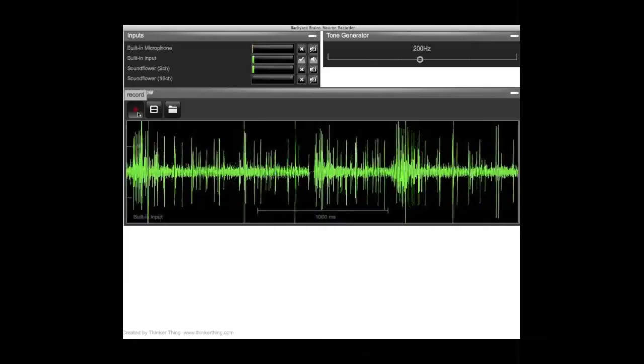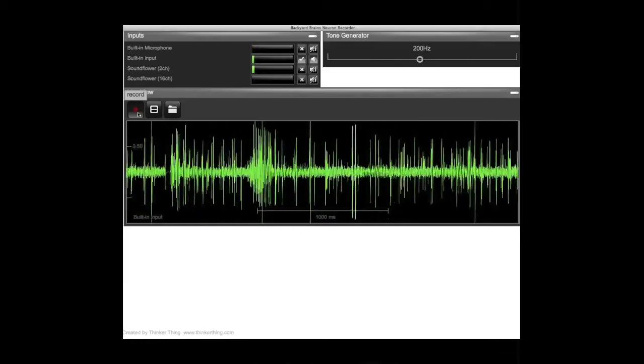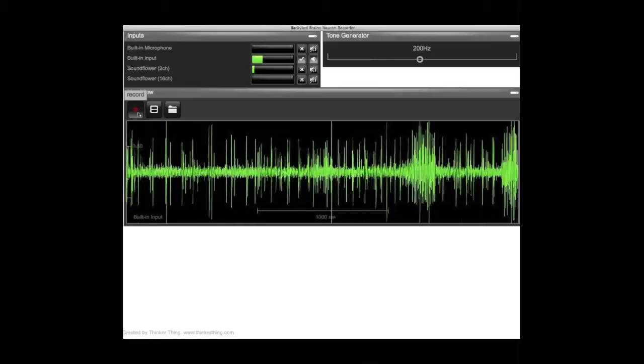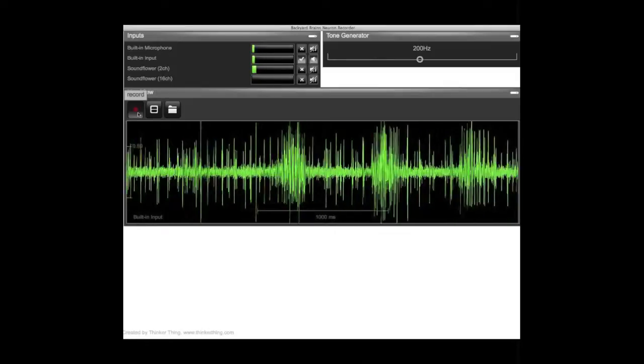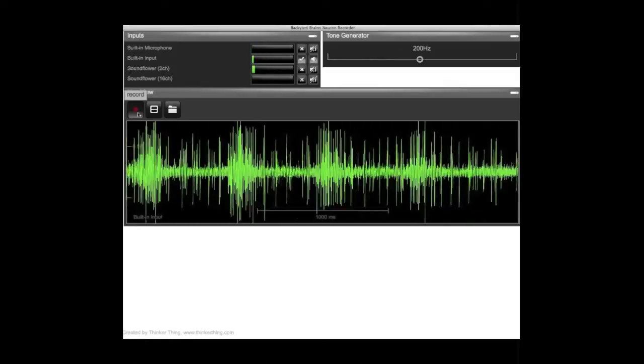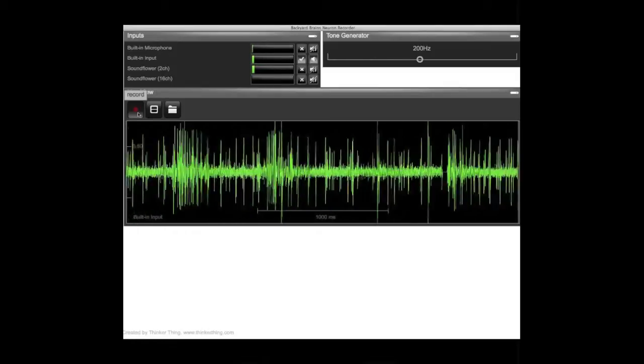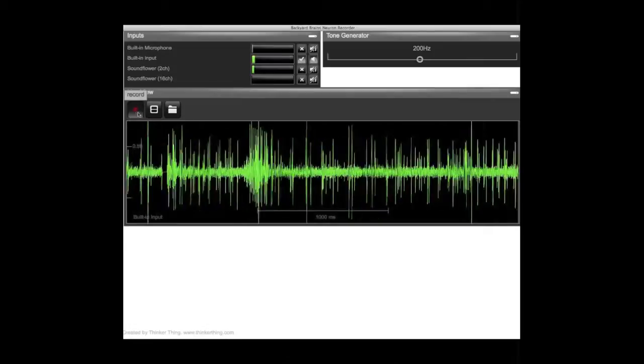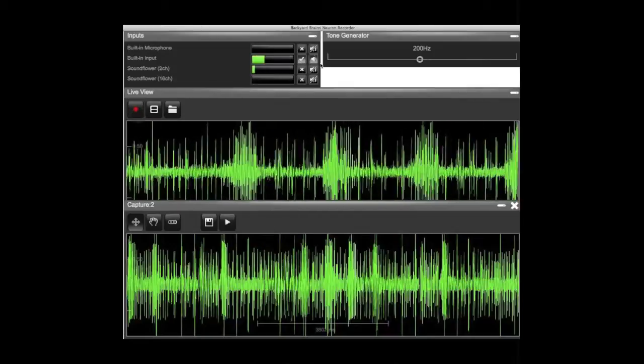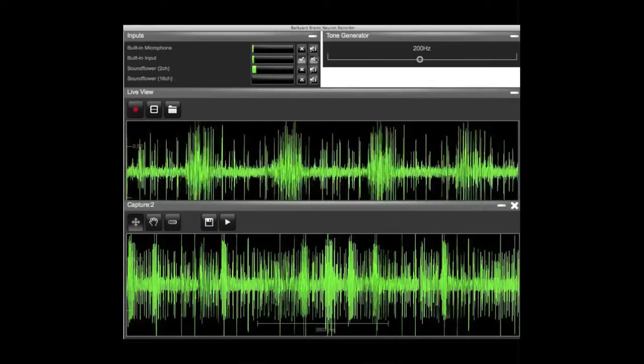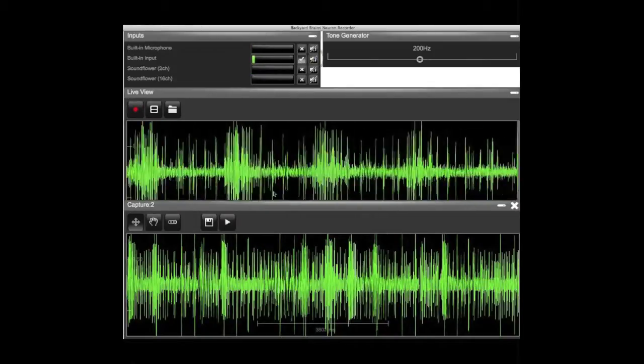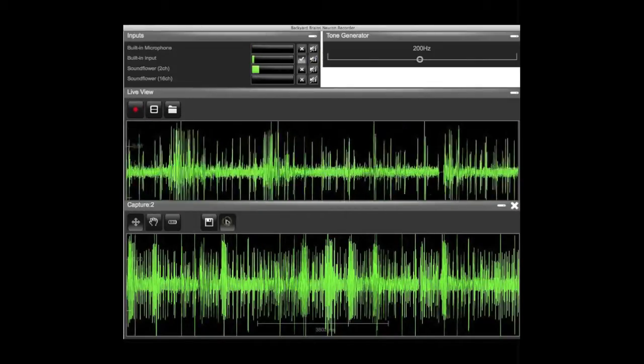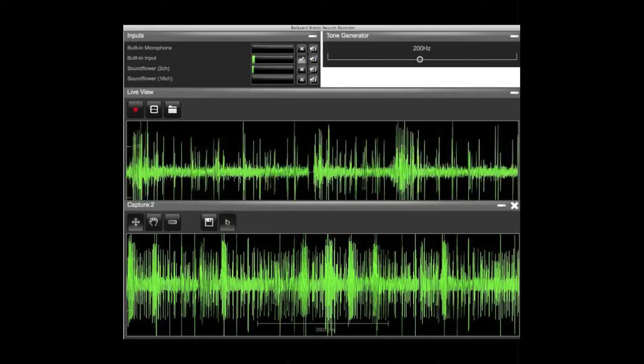You can also record your data by hitting the Record button. And there's our lovely file. You can play it so you can hear the recording you just made.